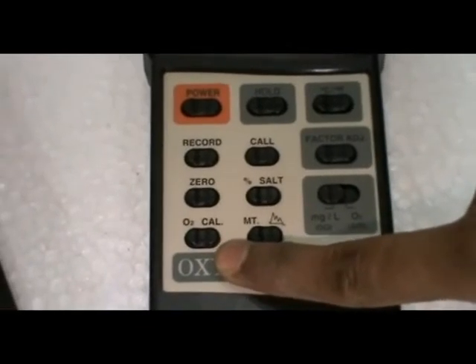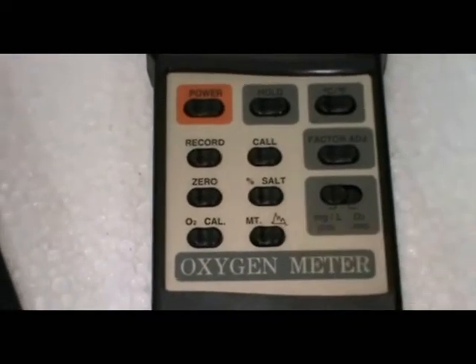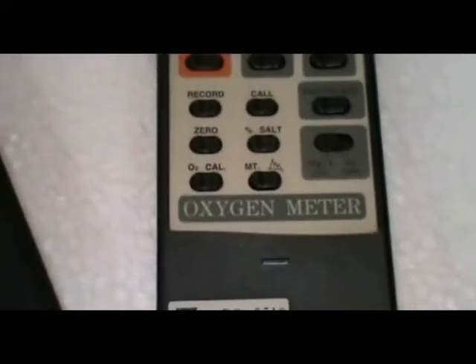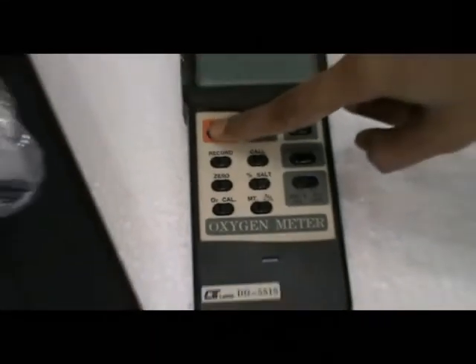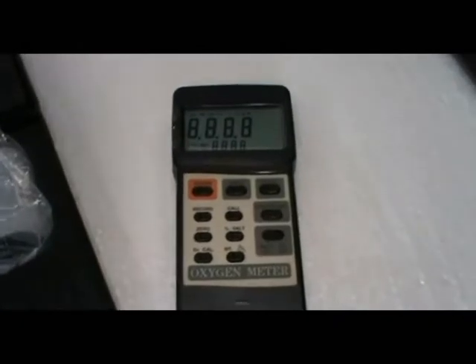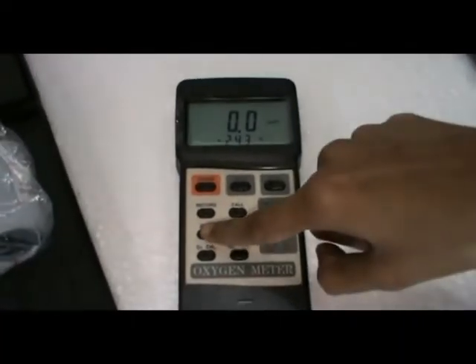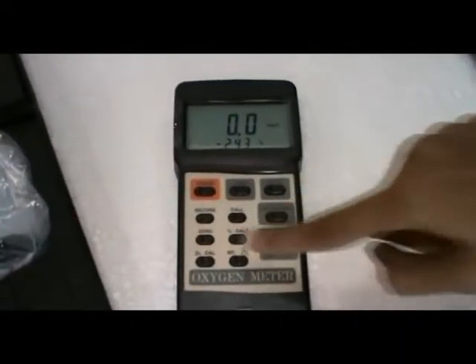Go to calibration. Switch on the instrument. Press the zero. The display shows 0.0. Connect the probe.